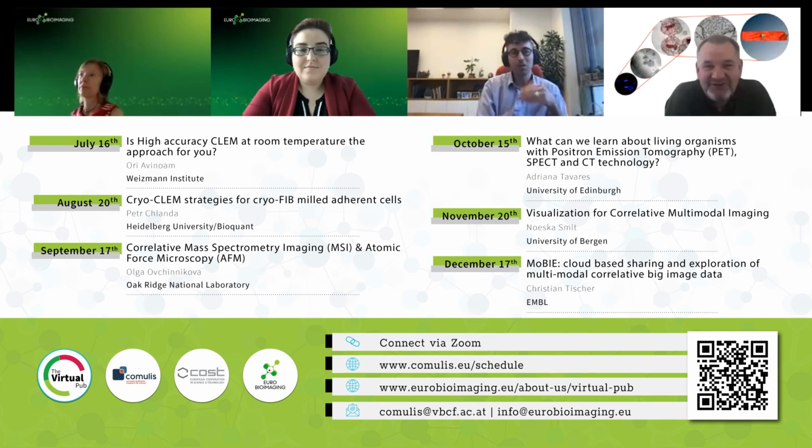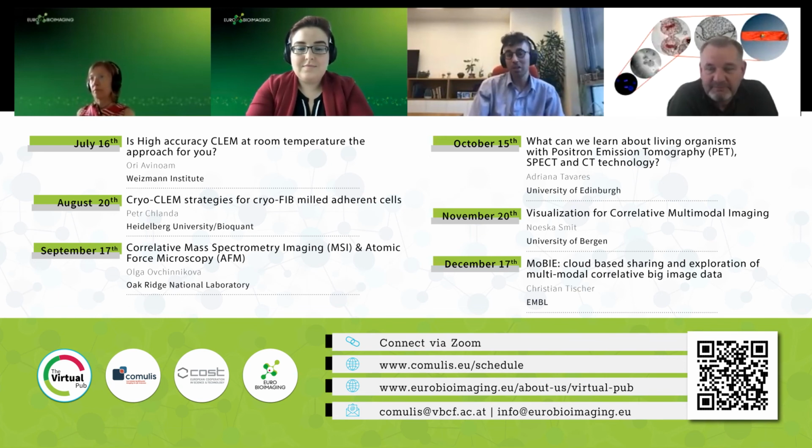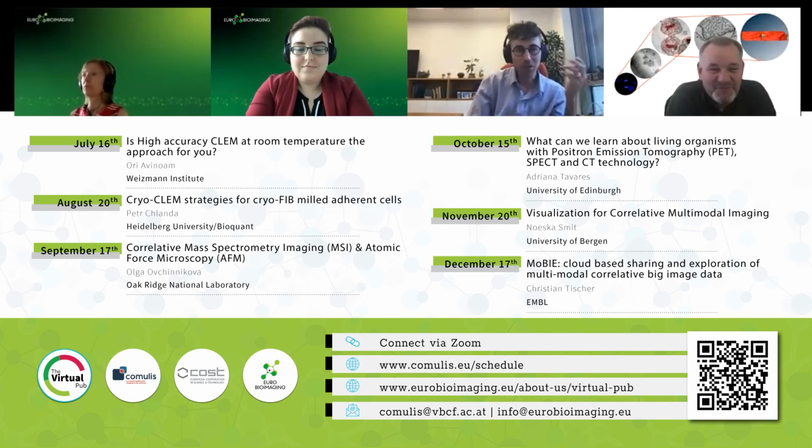increase the throughput higher by somehow automating, for example, the recognition of the fluorescent signal. Could the fluorescent signal be automatically segmented, and then the two maps automatically aligned? And so the whole procedure can be pushed even farther, and the answer is absolutely yes. And actually, EMBL has been instrumental in developing some of the tools, and they are published and available, and you should look into them.